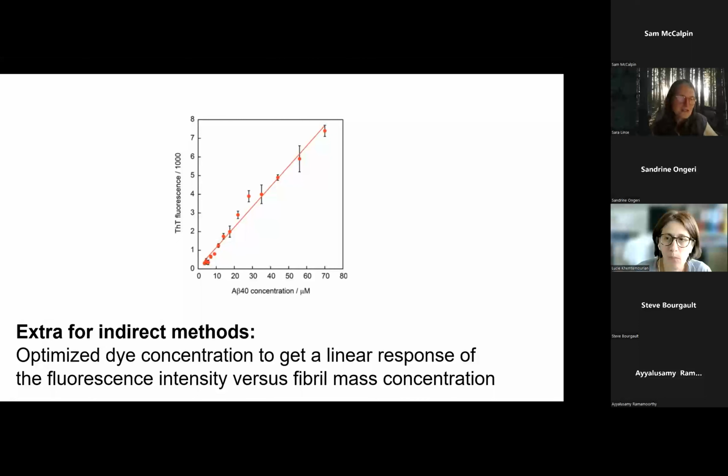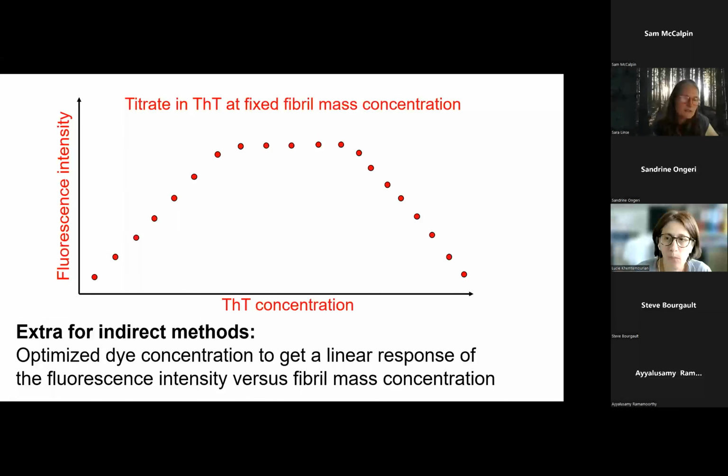you have decided. And a way to decide is actually to take a sample of fibrils. So first make fibrils of your protein without thioflavin T. So don't follow it with thioflavin T, follow it with something else, for example, CD spectroscopy or NMR, or take an aliquot that you don't follow at all, and then afterwards take out a little bit and add thioflavin T just to validate you have fibrils. Okay, then you have your fibrils, and you titrate in thioflavin T and measure the fluorescence intensity.